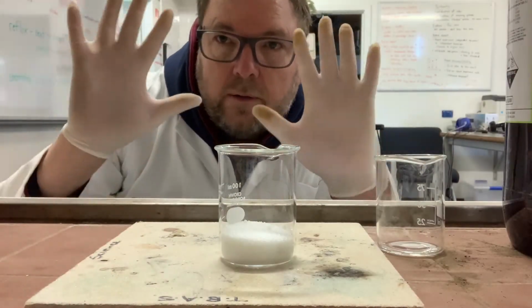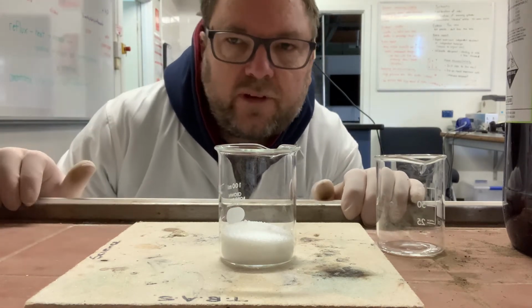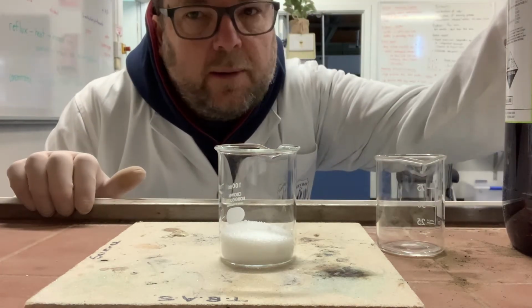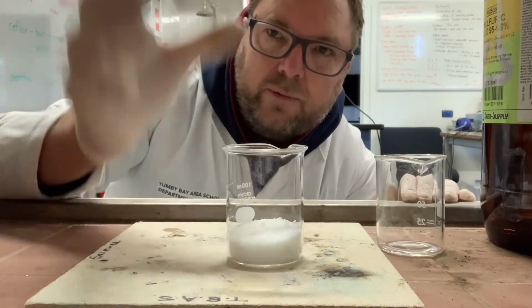Okay, we've got gloves on, lab coated up. We're actually dealing with some quite dangerous chemicals with this prac. This is why it wasn't one I could easily bring on the road. Just to demonstrate, one of the chemicals we're using is concentrated sulfuric acid, which we're using as our catalyst. I'm not sure if you've ever seen this done before, but it's a really good demo.